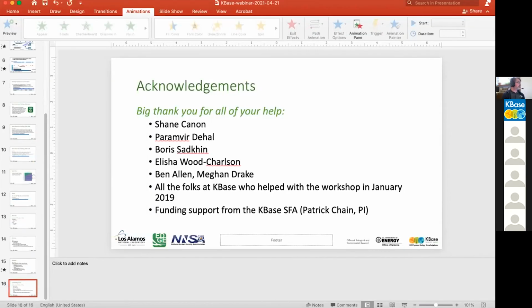So I'll check to see if there's any more questions in the chat. I think I might have answered them all. Maybe. Oh, okay. Sorry. How does Gotcha2 deal with complex samples where the likely taxa don't match reference databases? Well, yeah, of course.